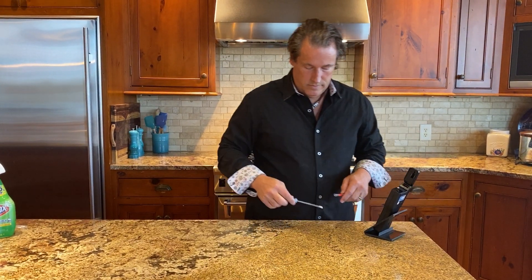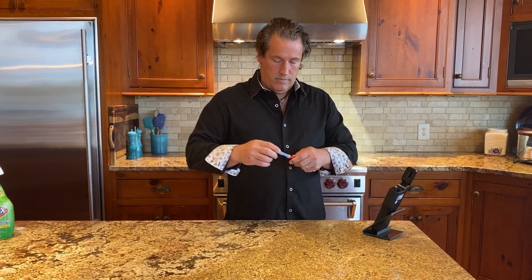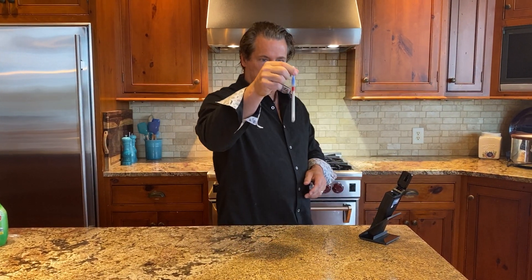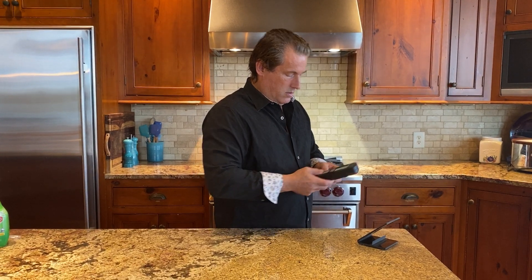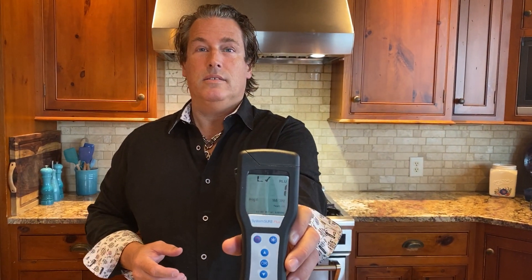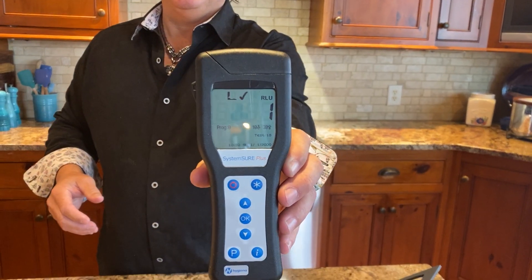Let's just see what we get now. Is each of those a swab? Yep. So break it, squeeze it, shake it, spin it, twist it, and hit start. It went down to one — holy shit. I was hoping to get less than 30, I'm not lying. Ain't no way I'm redoing that. Yeah, it actually went down to under one — holy.